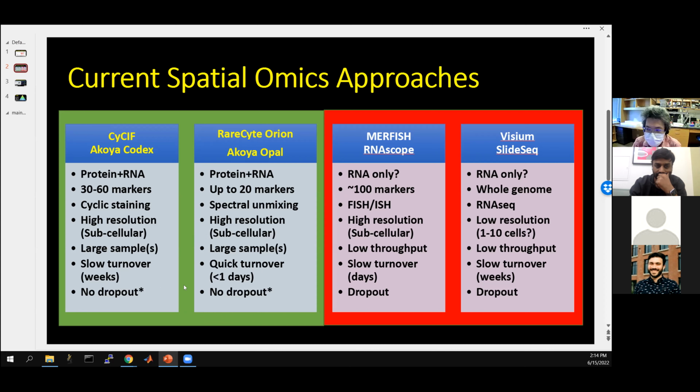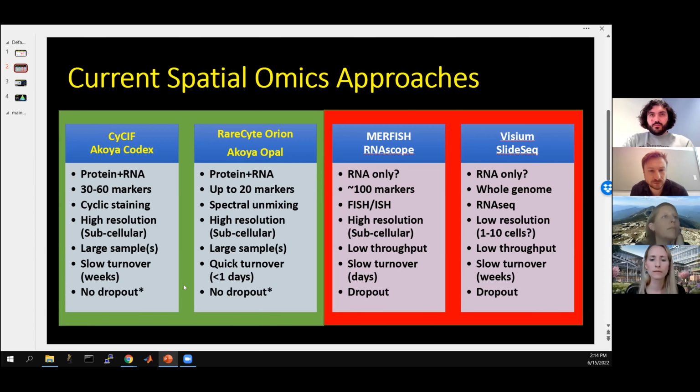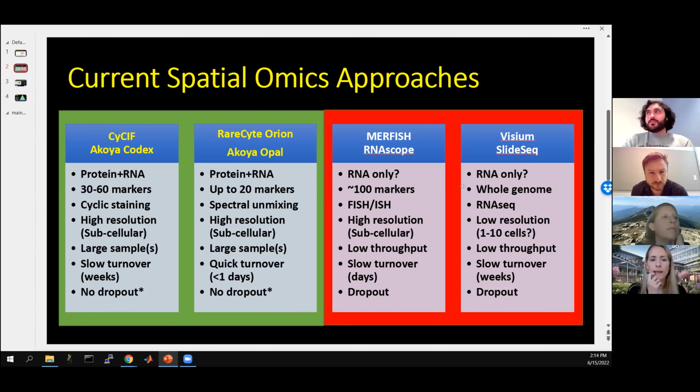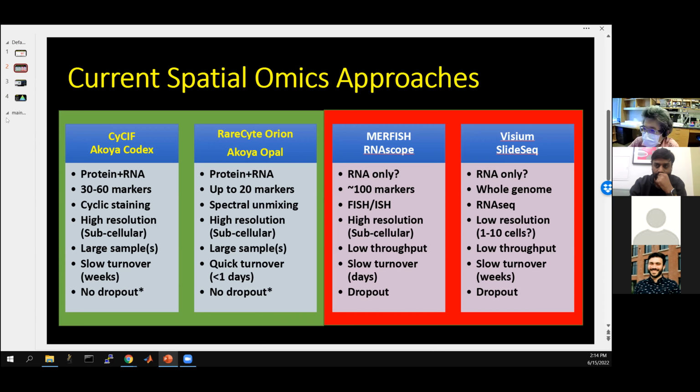So you can have a continuous distribution of your data. And for the sequenced approach or in situ approach, they are a different kind of measurement. So in a way, trying to come up with an approach specific to proteomics, or an approach that can join these together, is still underdeveloped, I always say, because I think the spatial transcriptomics methodology goes much faster than the image method.